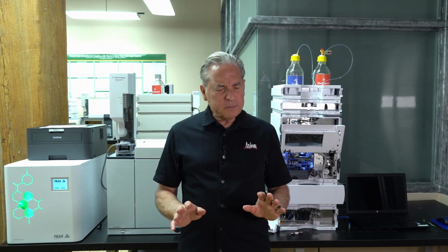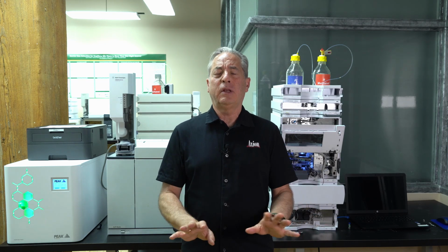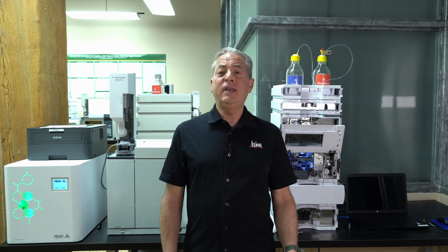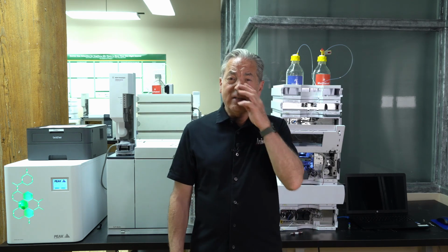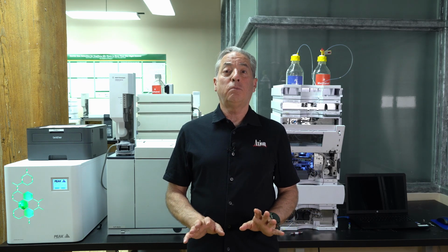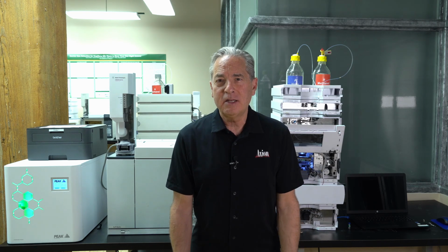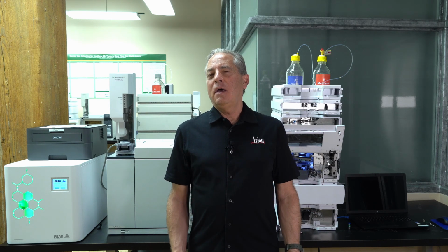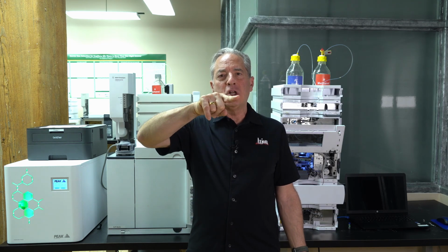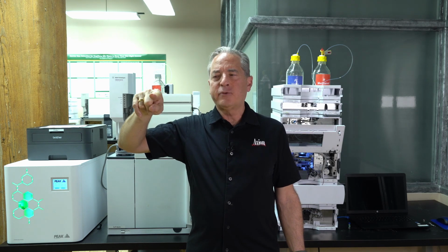And the LC, I treat a little differently in terms of mechanical stability. The first statement is the vast majority of maintenance on the GC is the inlet. In LC, it's the pump. That is where we're going to do most of the maintenance. But if you take care of the instrument, you shouldn't have to do a whole lot of maintenance. So my question in LC first is, how do I know I need to do maintenance? We look at what's called the pressure ripple, a short-term fluctuation in pressure. That should be less than 2% of the absolute pressure.